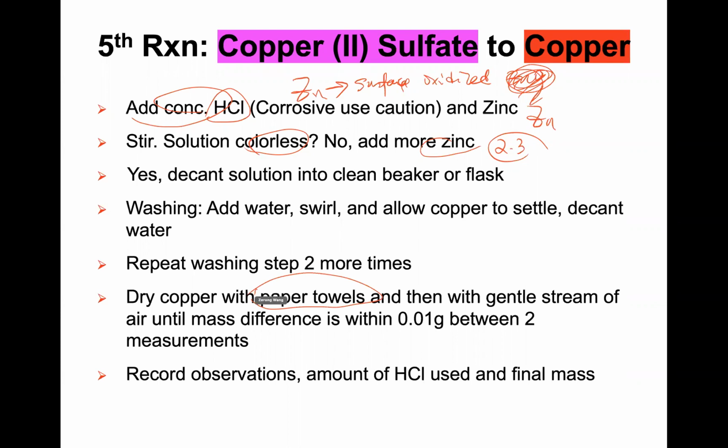Remember, you recover the copper from aqueous solutions, so it is always wet. You need to use a paper towel to dry it. Make sure the two measurements are no different than 0.01 grams, and then record the amount of copper recovered.